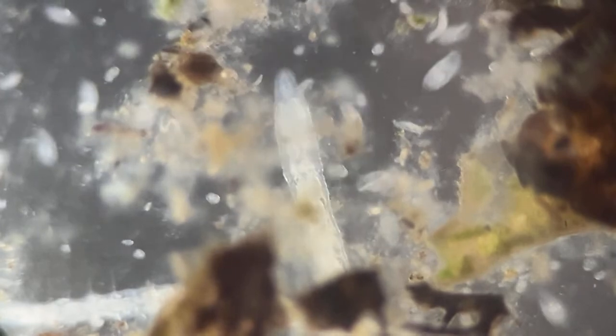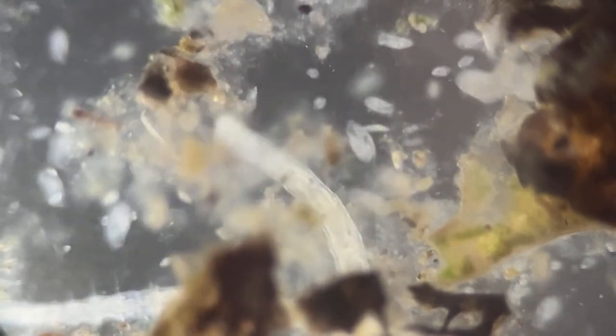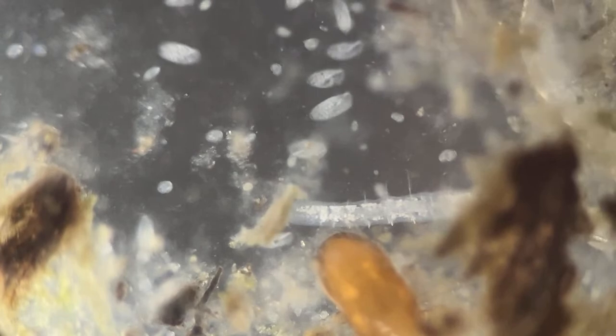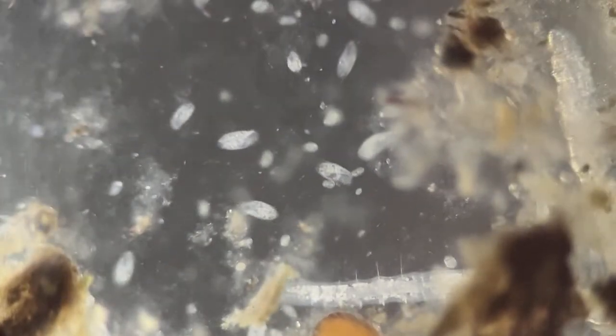Imagine living a life in a matrix where there is a three-dimensional array of organisms in high density, and you have all the ways to move: up, down, left, right, forward, backward. In all possible dimensions you can move. And imagine the sort of hegemony all around you as you see in here. All right, wonderful sight it is, isn't it?